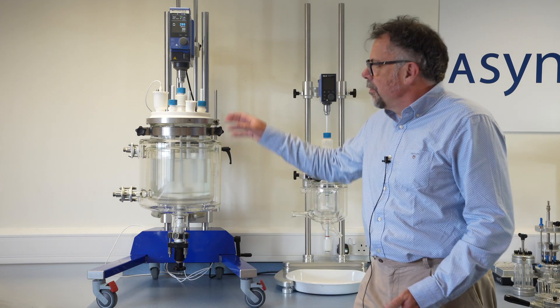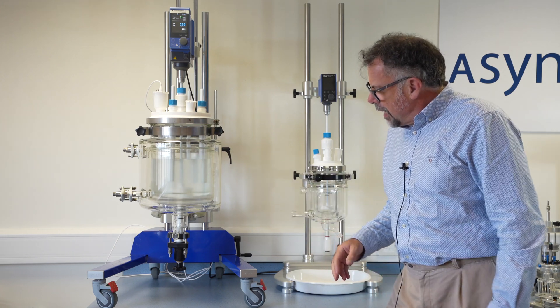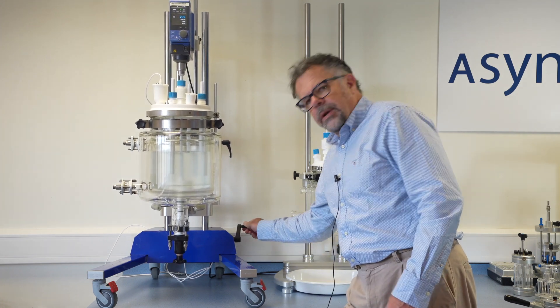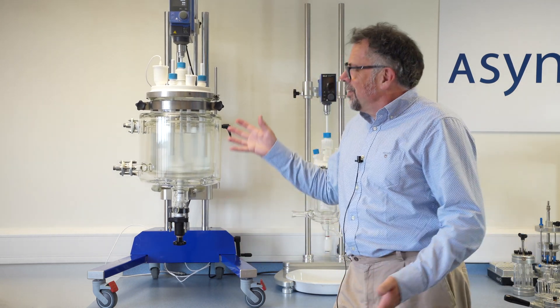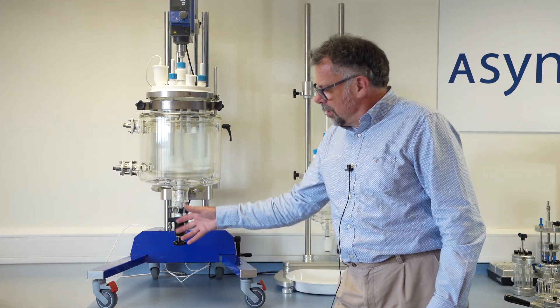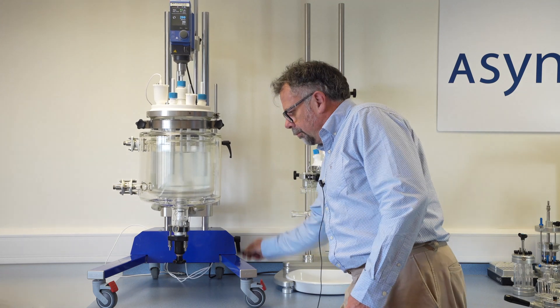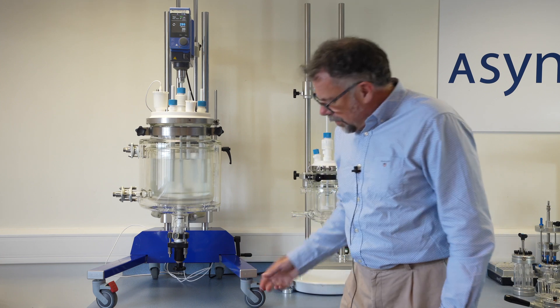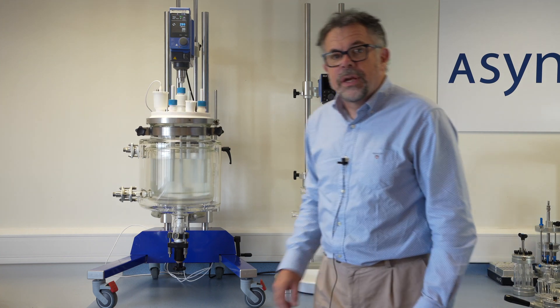The height was too high really for people to safely make additions to the top. So what we came up with was this simple mechanism — as you will have seen, the whole vessel assembly comes up including the overhead stirrer, so it gives you the space to collect your material underneath into another vessel. And when in the lower position, even with the casters on, you can quite easily get to the top of the vessel.